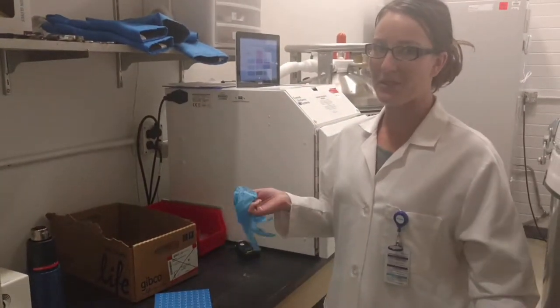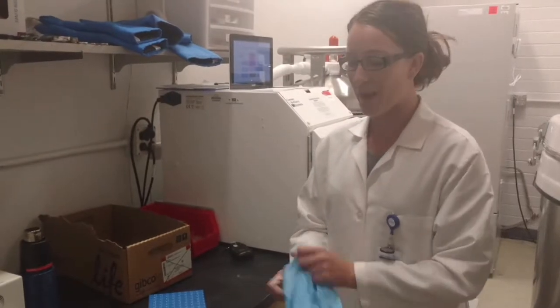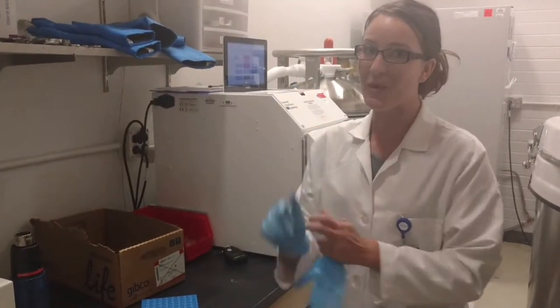Hi, my name is Angela at the Biorepository. Today we're going to demonstrate how to remove an overwrap. First, you want to make sure you're wearing gloves.